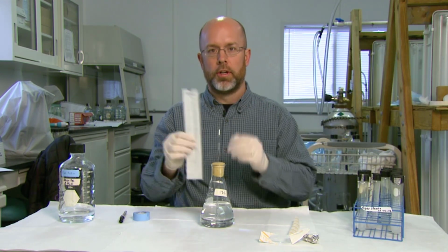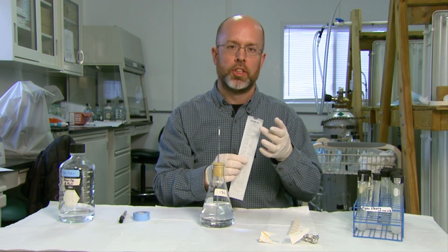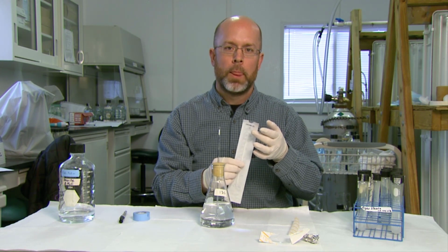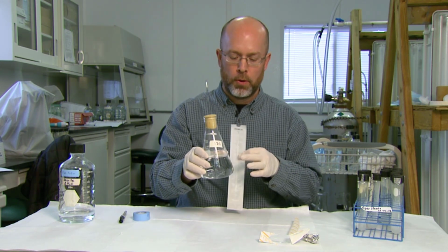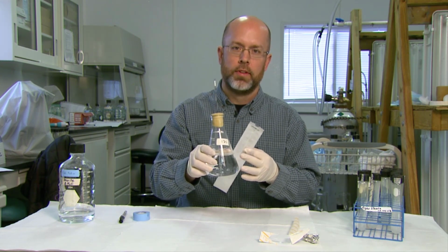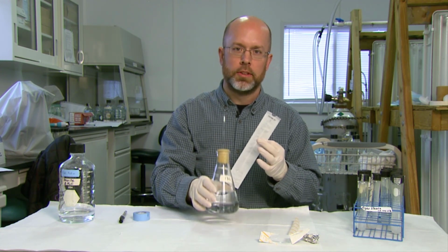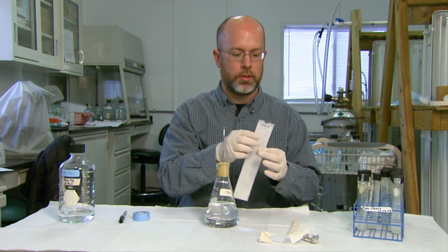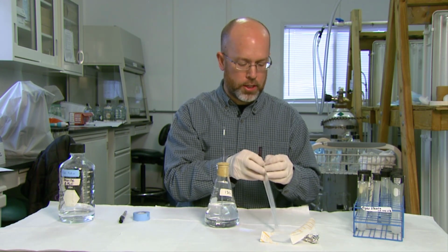So again, you need your sterile loop just like we used before. In this case I'm going to use the large loop because I want to get a large inoculum in here. And just as I mentioned before, if there's not enough algae in here and it's not dense enough, the UV light coming from your light source can break down the cells and cause your culture to crash. So we want to get a nice strong inoculum in there.